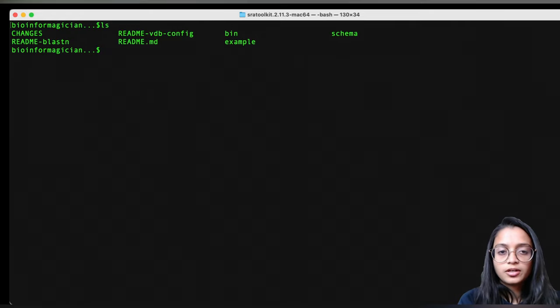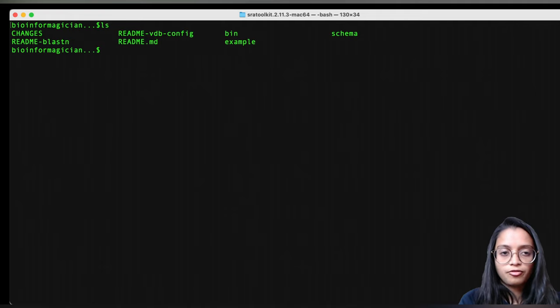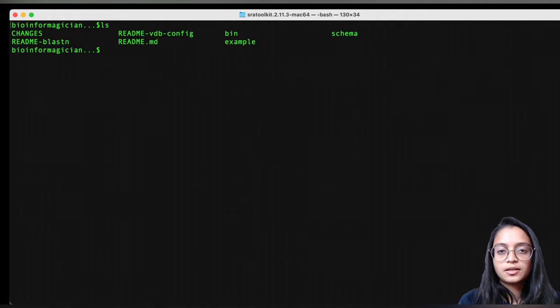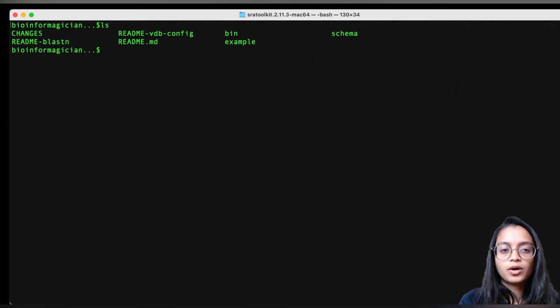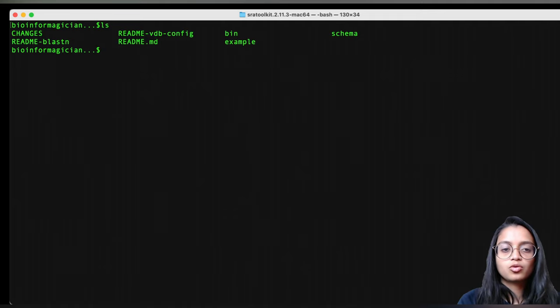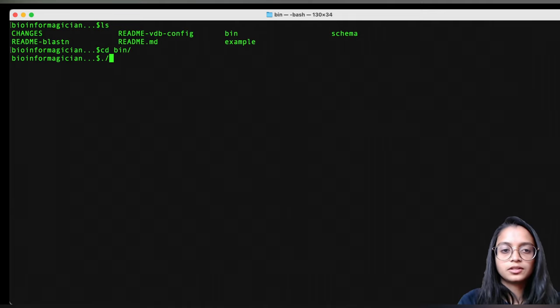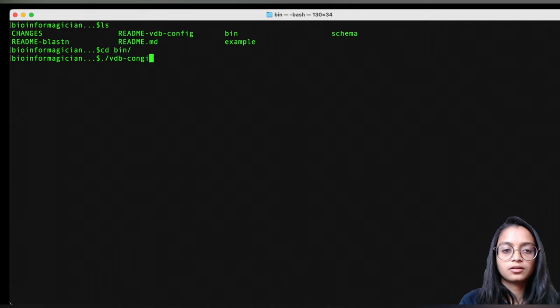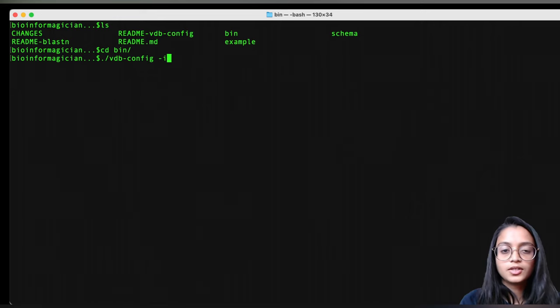The next step is to configure the toolkit now that we've successfully downloaded and uncompressed it. The executables are always present in the bin folder, and we'll need one of those executables to configure this package. So let's go into the bin directory and configure using the command vdb-config with the -i flag and run it.